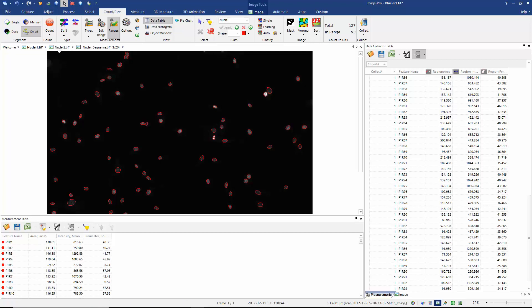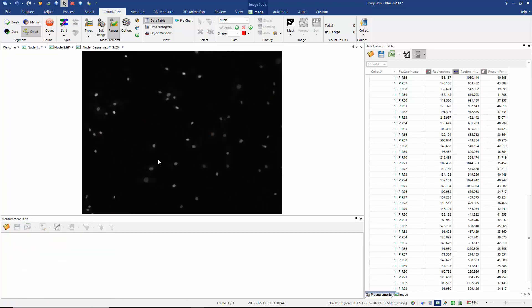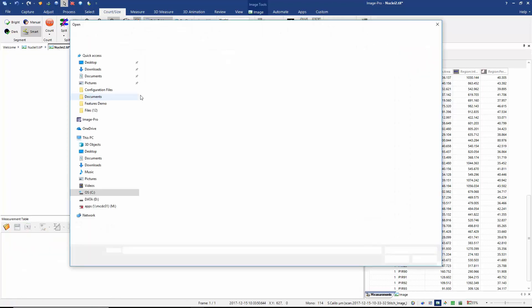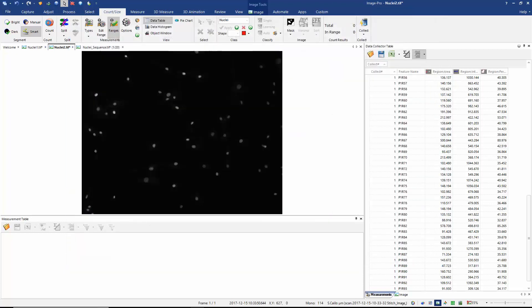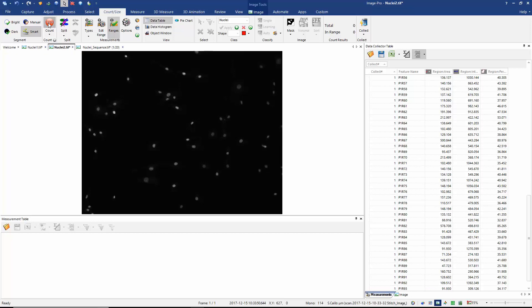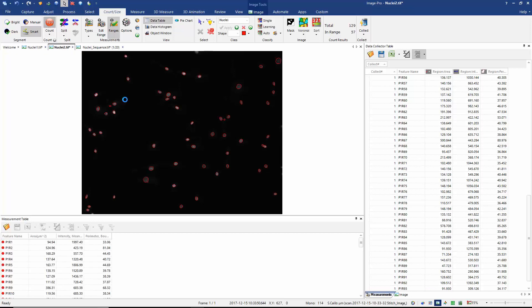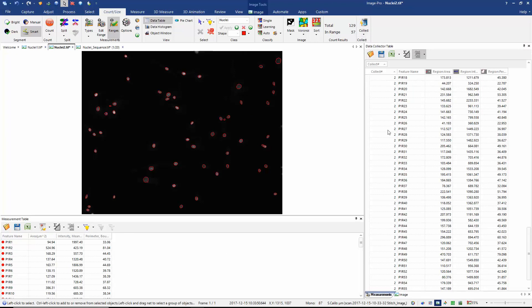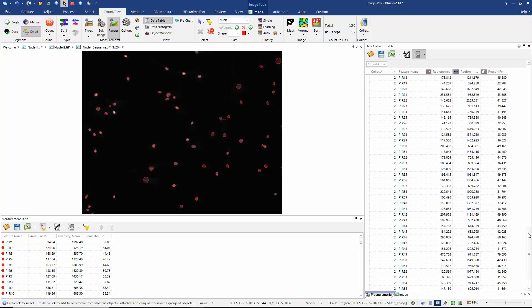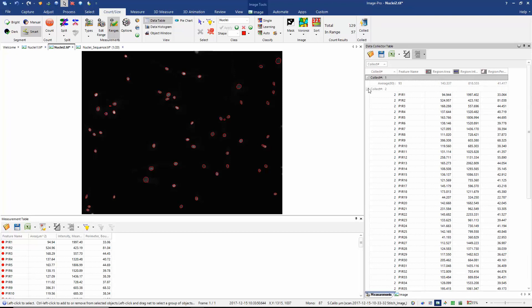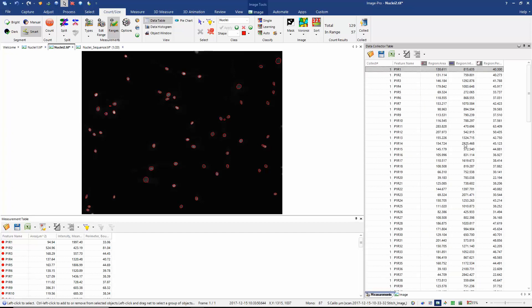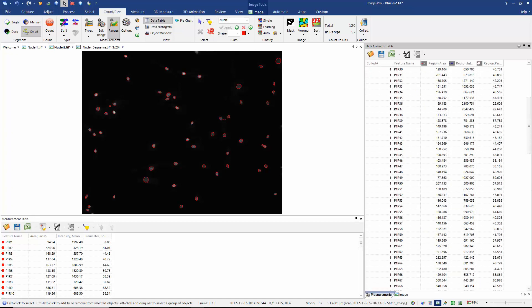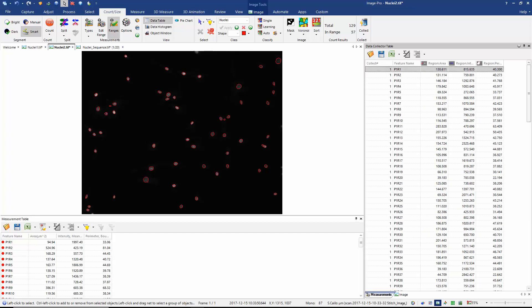Now I can move to my second image. I can restore my measurements options, I can click the option to count, and again we measure all of the nuclei in the image. Here we can see the measurements are made in the measurements table. And if I hit collect we can now see that in the data collector we have two collections being made. So here we see all of the raw data from collection one and collection two.